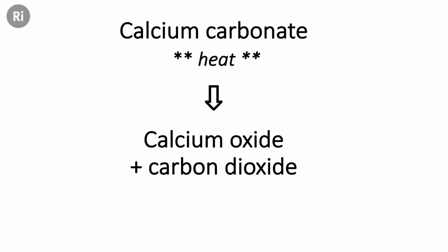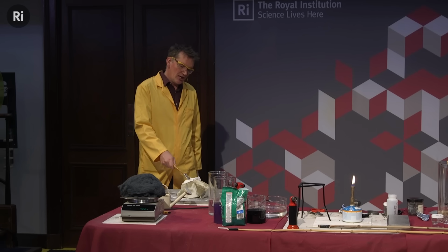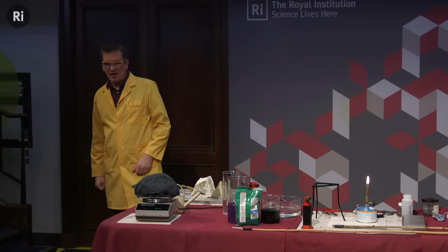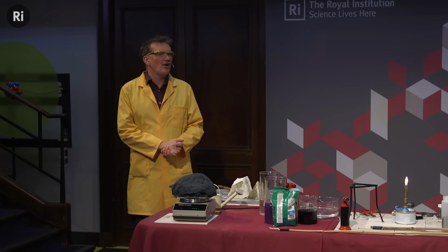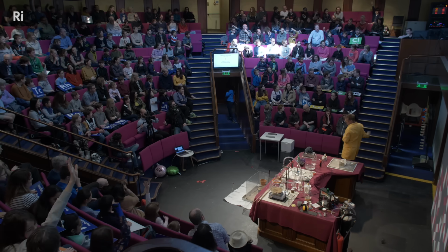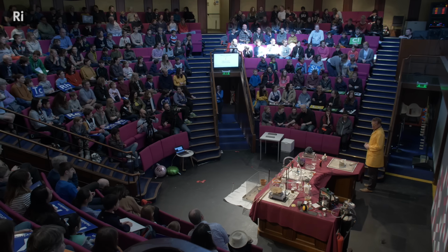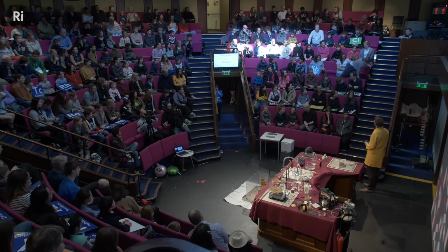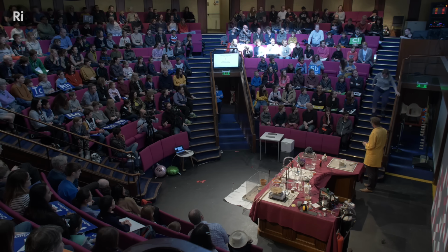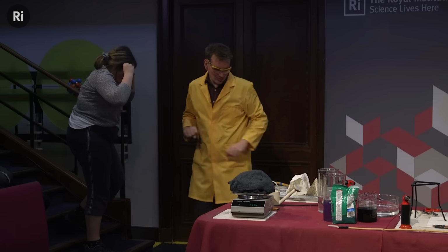So this was included in Lavoisier's list of simple substances. It's quite hard. It's not hot. It's just been lying around here. But it can do something really quite fun. And I need a volunteer. Oh, your hand went up very quickly in the gray. Do you want to come down, please? Okay. Thank you. And you might need to see if you can put those over your goggles. Yeah, so extra goggles. This is good.